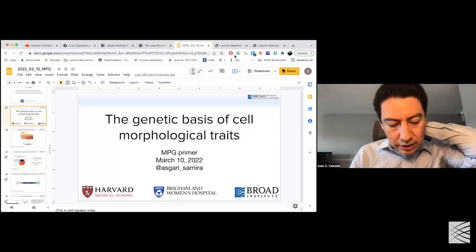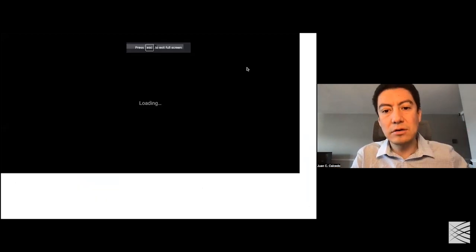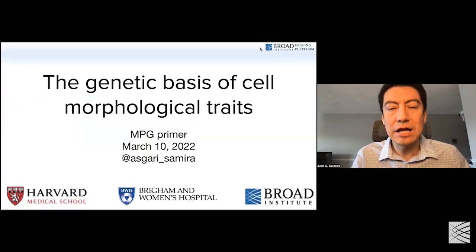There are also newer methodologies for extracting features based on deep learning. In those cases, instead of defining the features ahead of time, you let an optimization algorithm find the most relevant features for this specific set of images that we have. Running both, we did a comparison and we pretty much obtained a very similar answer.